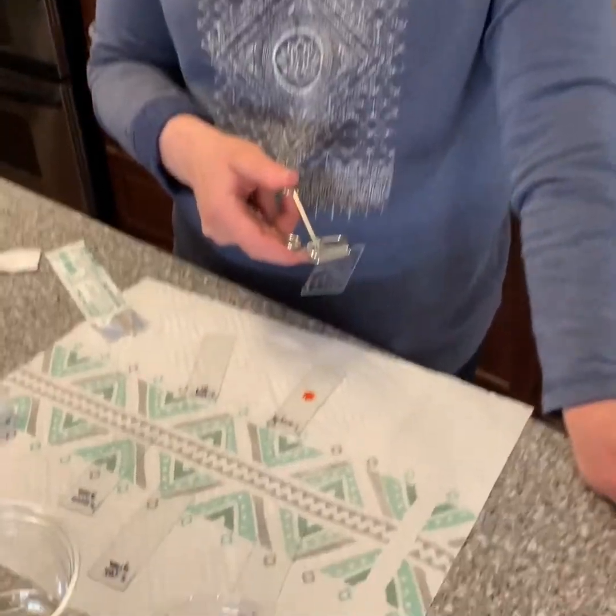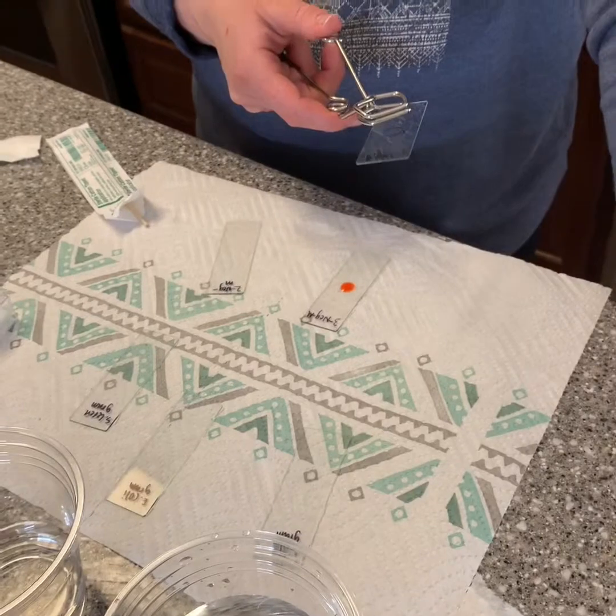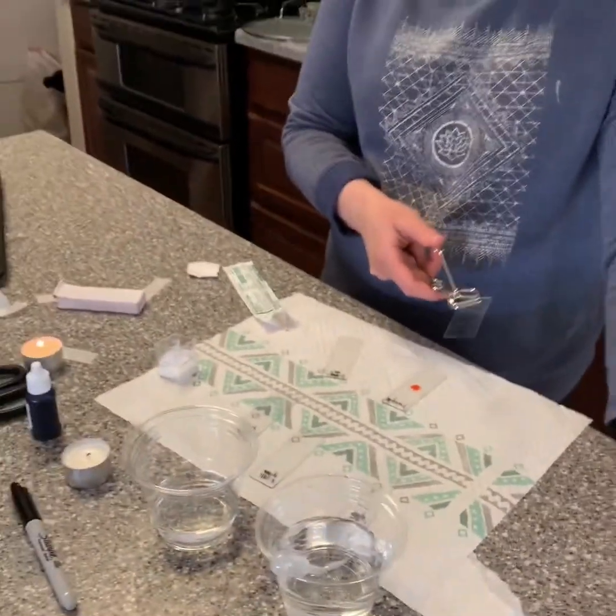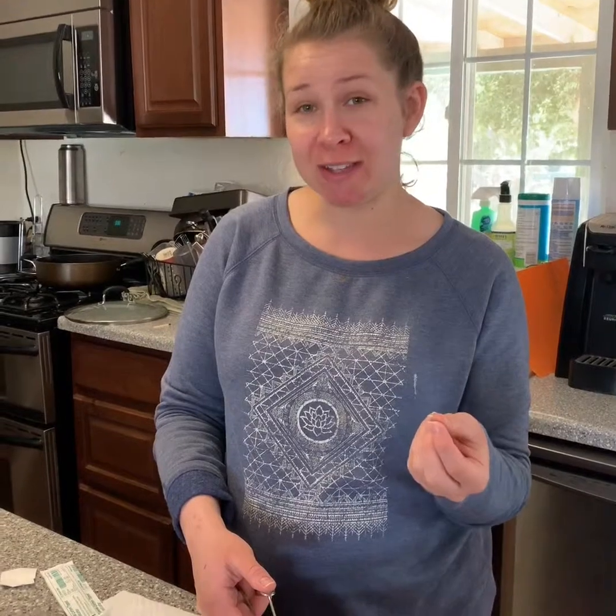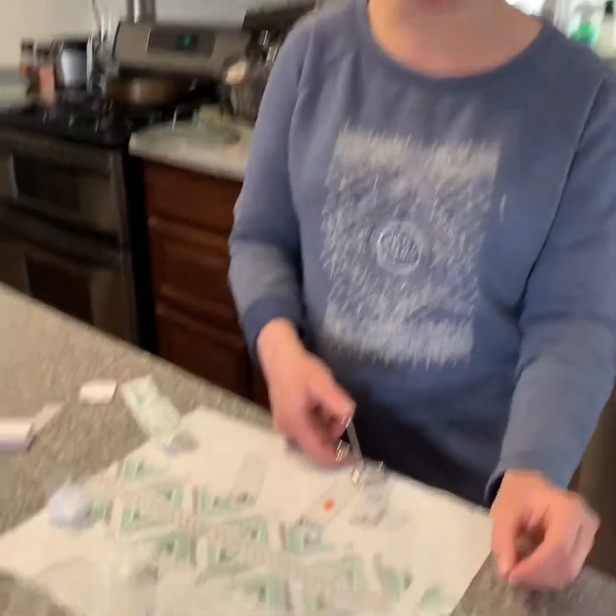Hi, Rachel Ayala here. This is bacterial morphology and staining techniques and I'm going to be making my slides. I'm going to be starting with my two mouth and gum slides. The first one I'm going to use the crystal violet stain and the second one is the congo red stain.